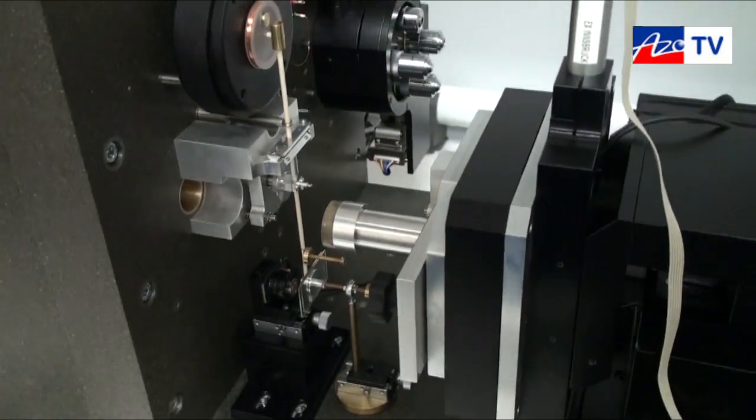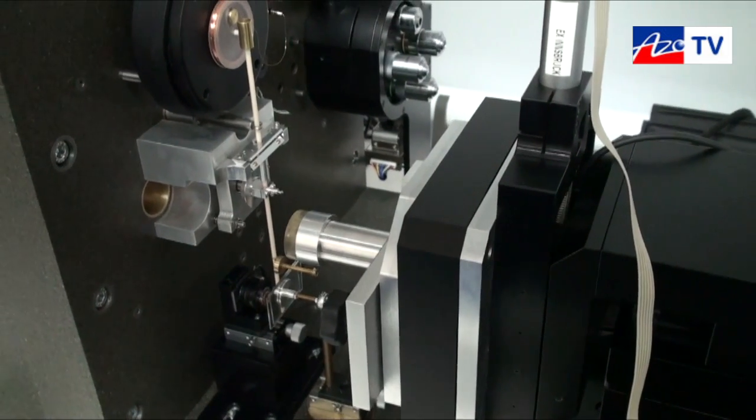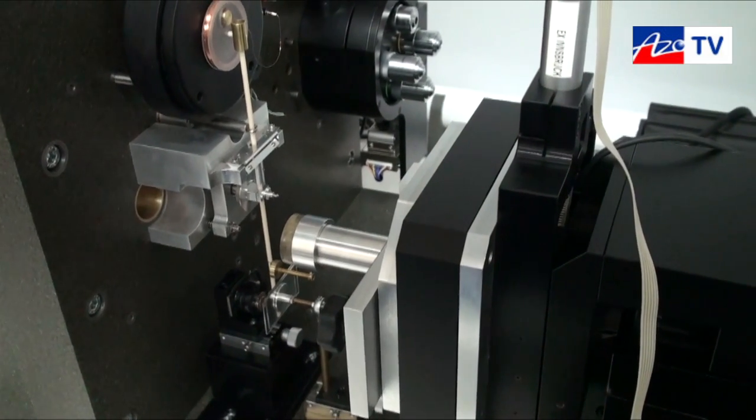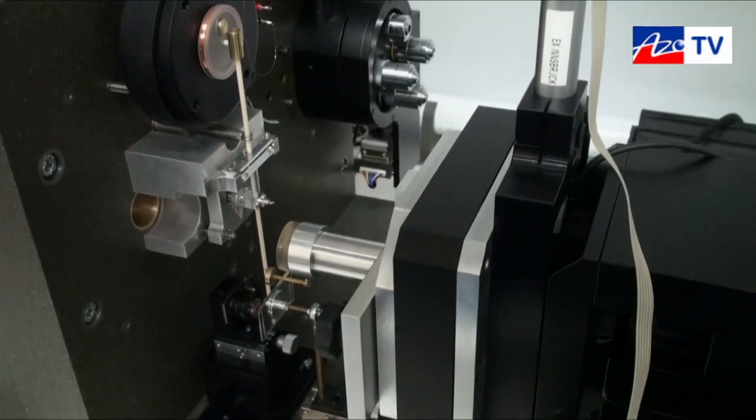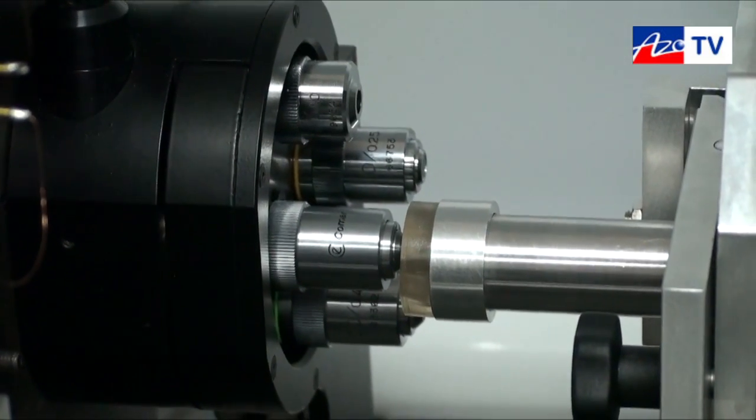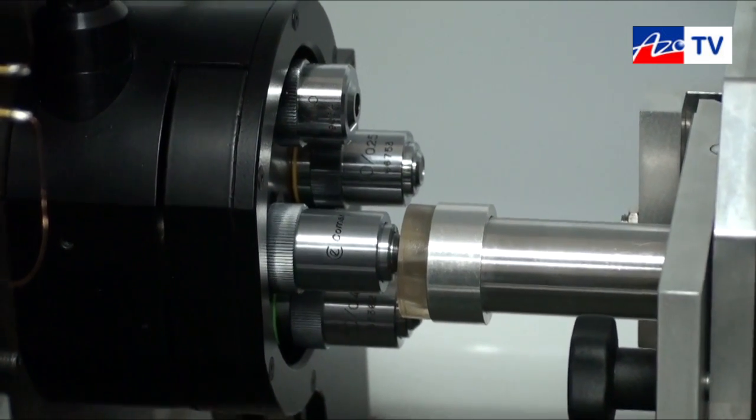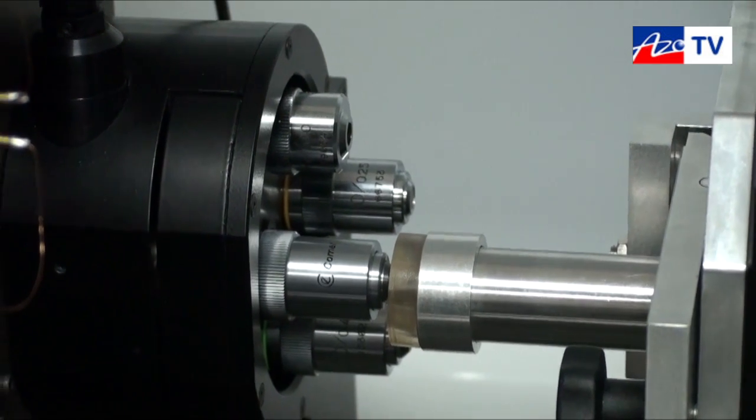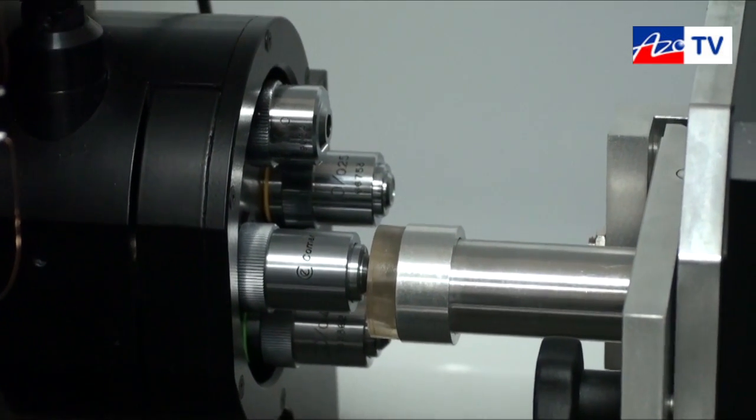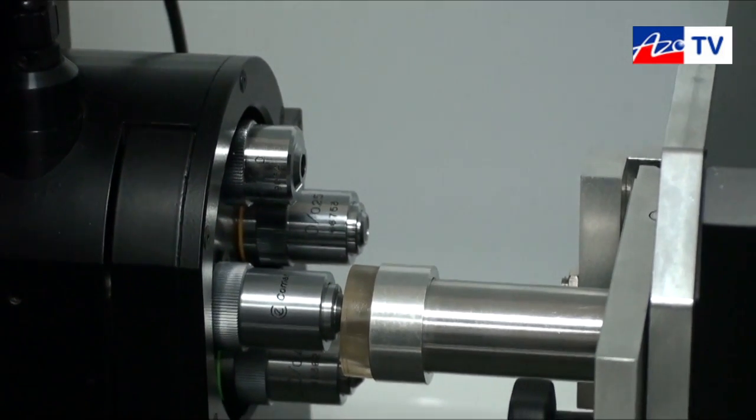The way that we run experiments on the Vantage is we start by lining them up under the microscope. I'm just going to move from the indentation position over to the microscope position. This means we can identify areas on the surface where we want to make our indentations. We can either set up single indentations at individual points of interest or we can set up grids to look at areas of the sample which are of interest.